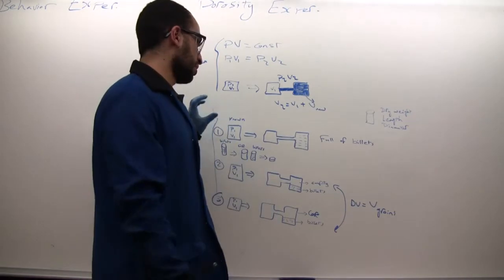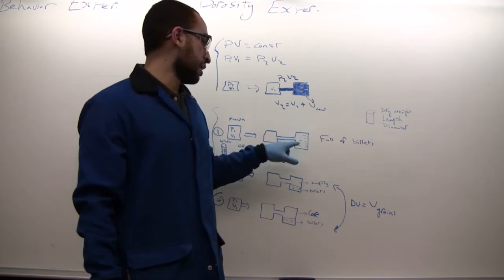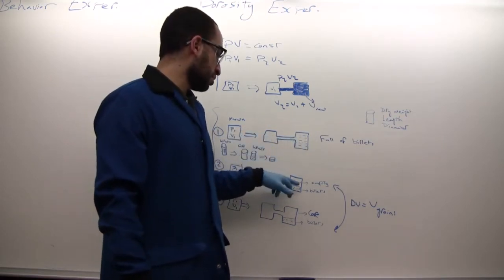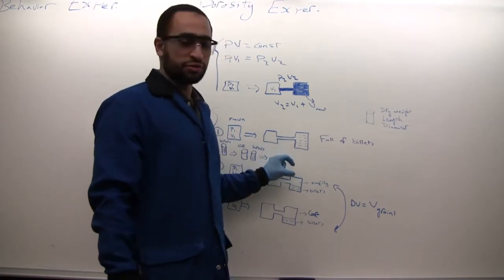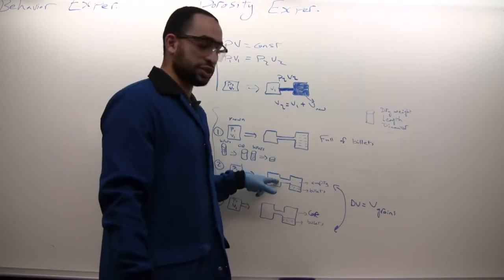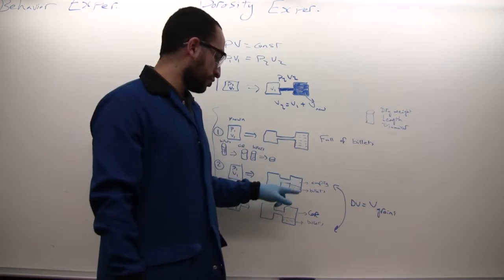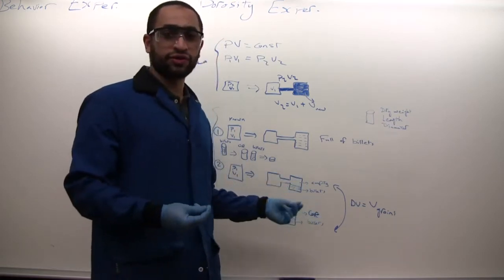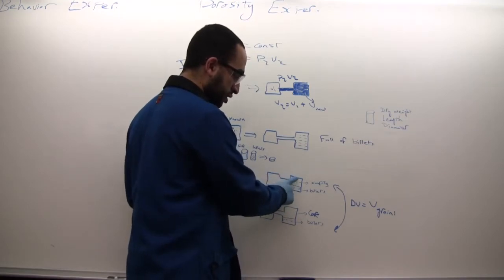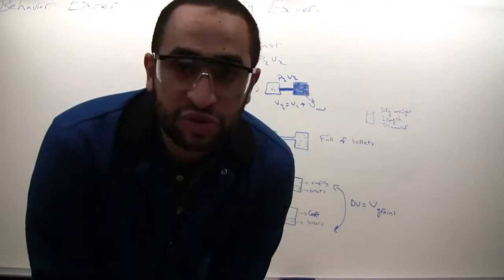So in the beginning, we put a full stack of billets inside my second chamber and get the volume of this connection and that chamber. In the second part, we remove a volume equal to the volume of my core, and I get the volume of this region plus the connection plus that first chamber, and then I put my core in here, and this way I'll be able to estimate the volume of the grains, which is going to be the difference between the volume V2 here and V2 here. So this is the idea of the experiment.